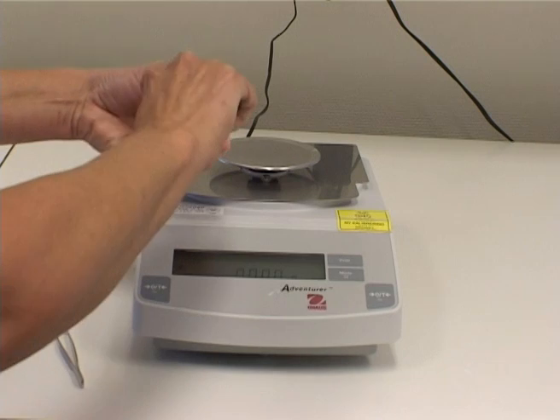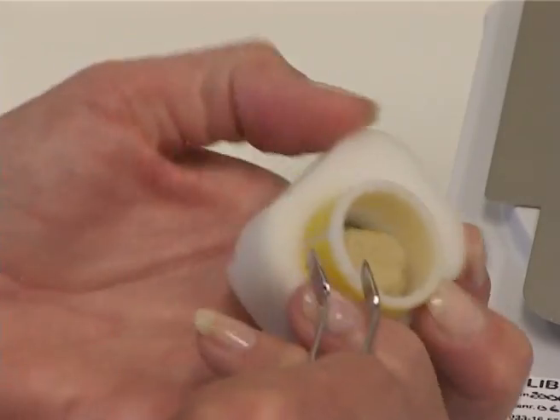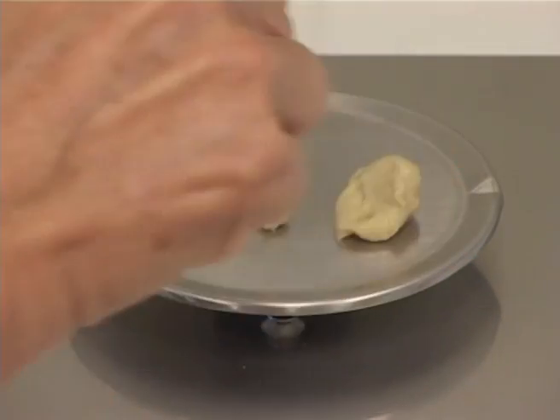Carefully scrape out the through fraction on the sieve and weigh this. Remove the rest of the sample from the other side of the sieve and add this to the scale.